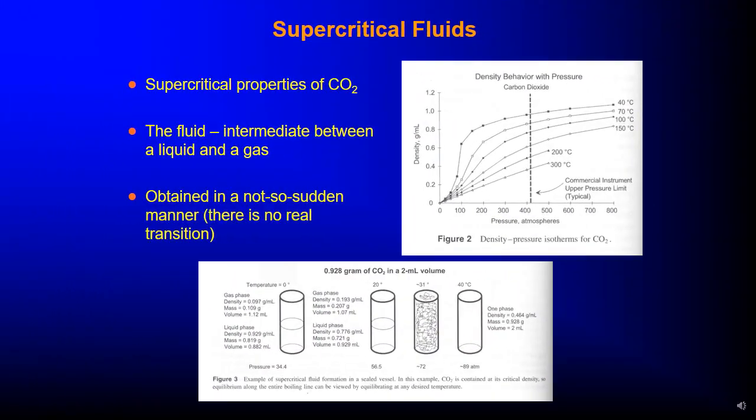Now, supercritical properties of carbon dioxide. It is a fluid intermediate between a liquid and a gas, obtained in a not so sudden manner.